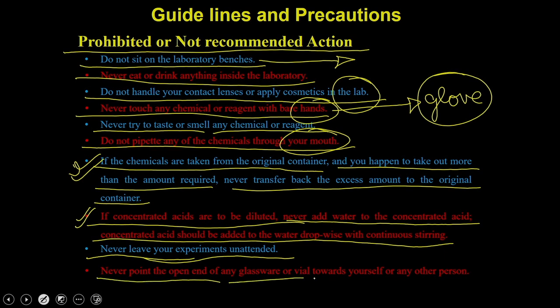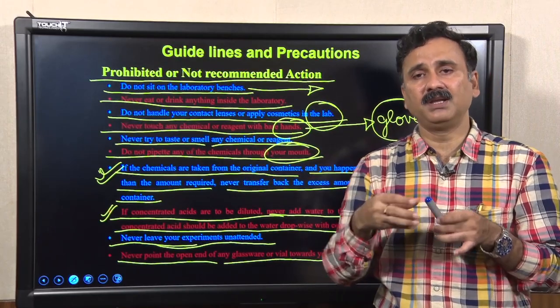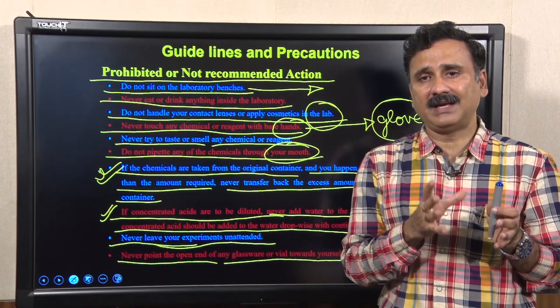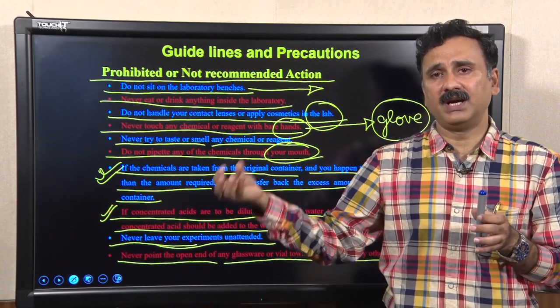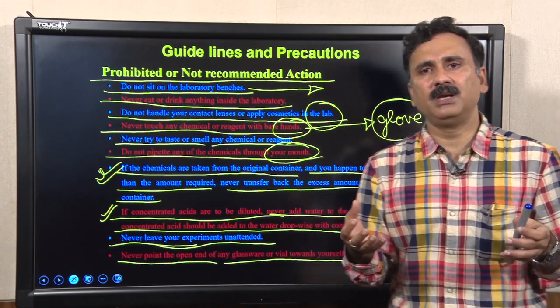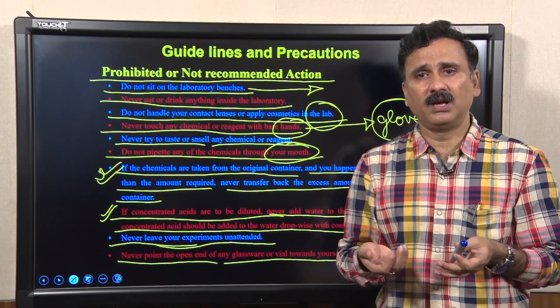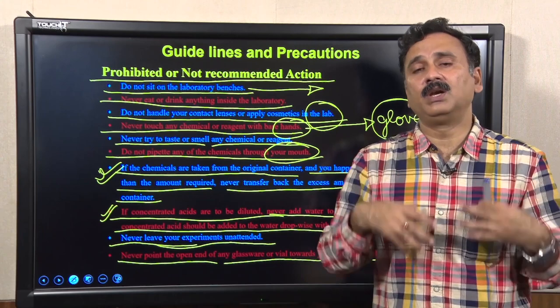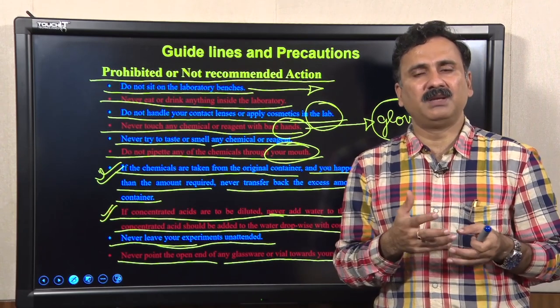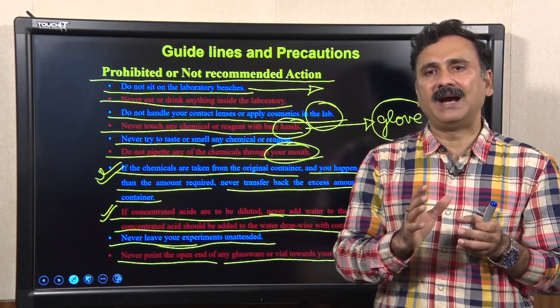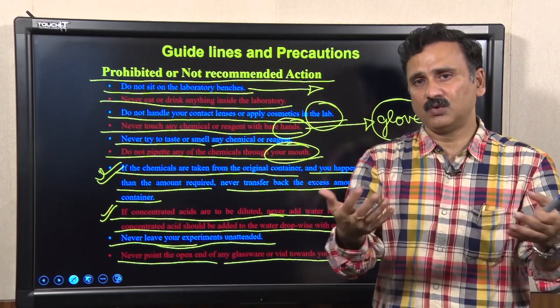Never point the open end of glassware or a vial toward yourself or any other person. When opening a container, always open it so that the mouth faces away from your face and not toward someone else. If a gas has built up or pressure has built up inside, liquid can spill out. Just as opening a soda bottle toward your face results in liquid spraying onto you, the same applies to chemical bottles — always keep the vial mouth away from your body and others.